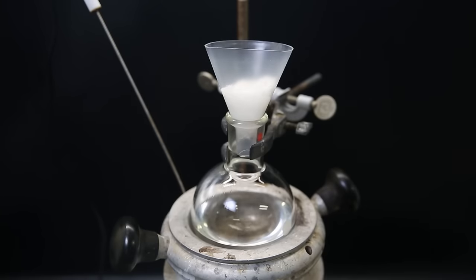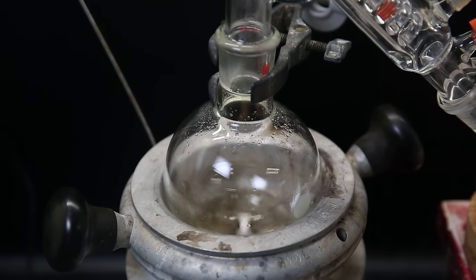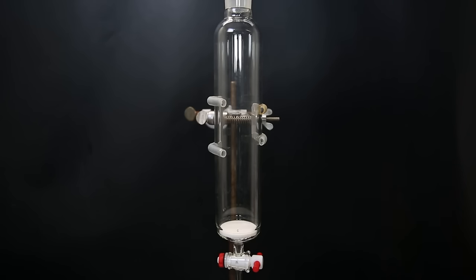I wash the beaker and filter with some more ether and then set the filtrate up for short path vacuum distillation to remove all of the ether. Afterward, I am left with a pale yellow oil. Now I still have to separate out the products from the citronellol and other impurities. So I will do a short column.